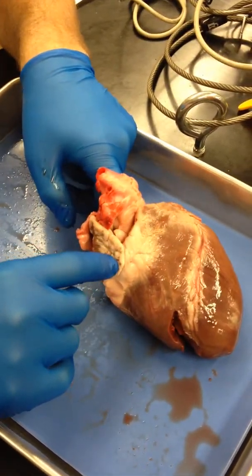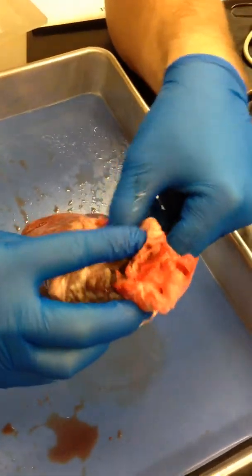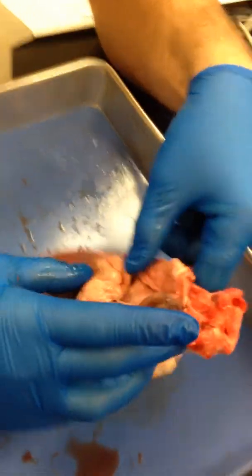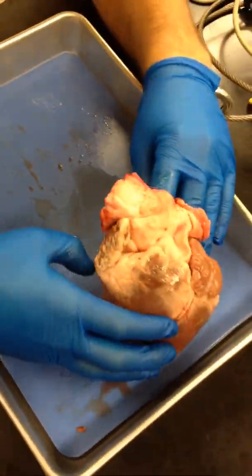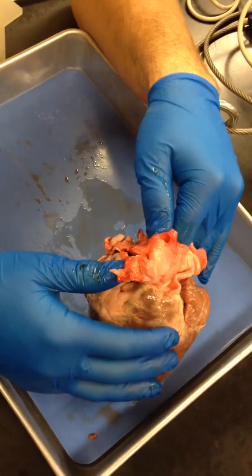But where is our — what's the other one called? Pulmonary. Or vena cava. Or where does it enter the right atrium? Any ideas? This is Junior, by the way. You guys know Junior? He's another one of our TAs.